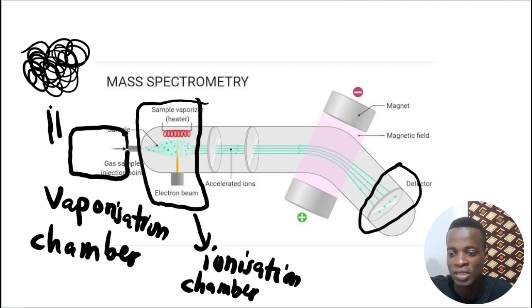This one is shooting very high speed electrons into this. The electron is so fast that it passes through the gas and hits another plate here, which is the heating element at the top. So the electron gun is like a gun shooting the electrons, and the electrons will pass through the gas and come in here and stick at the top.